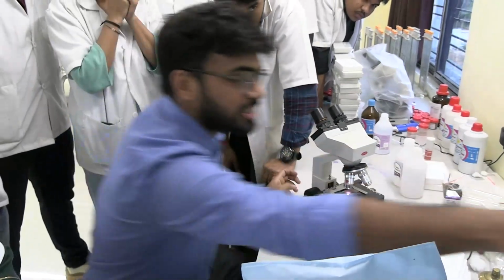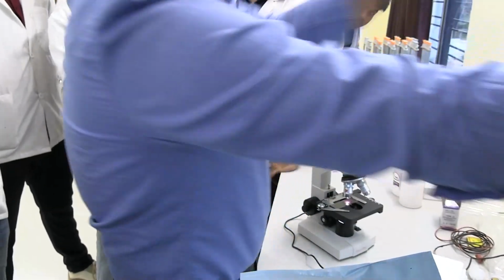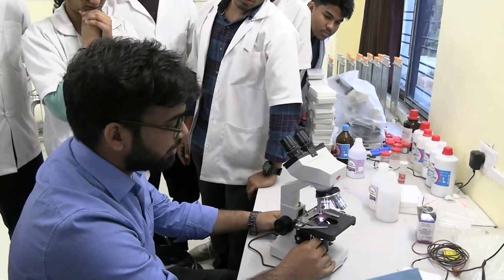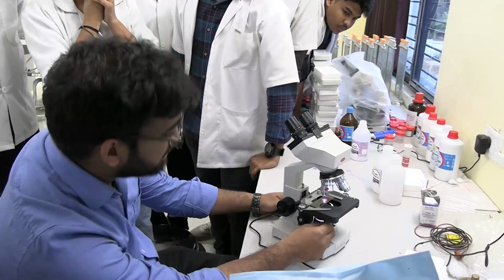What does diaphragm mean? It is a curtain. Suppose this is the curtain. If I open it fully, what will happen? More light should enter. That's what is happening here. See, more light is entering now. When I close it, less light is entering here. This is the light source, an artificial light source.